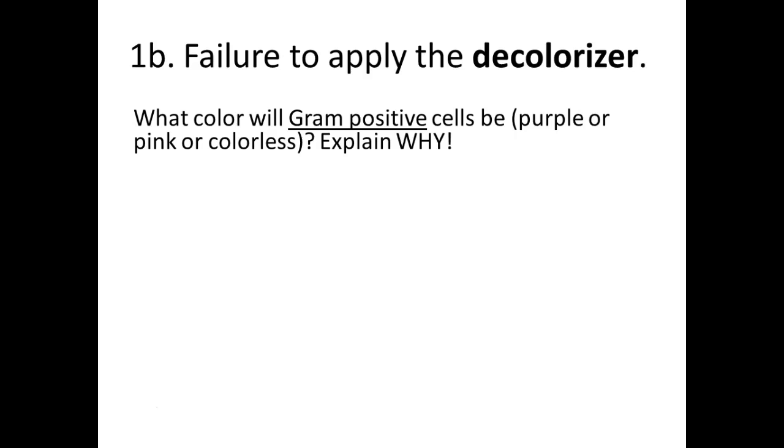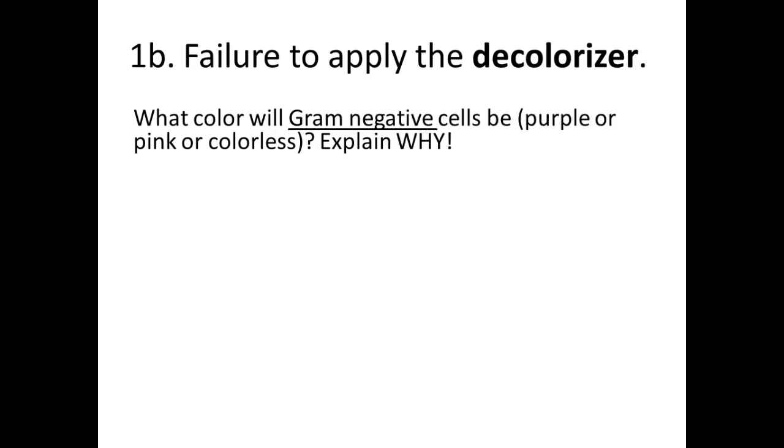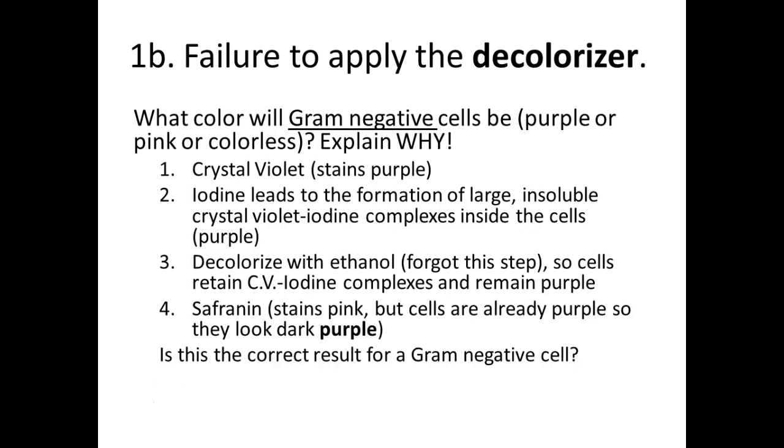Okay, what happens if you don't decolorize? Are your gram-positives going to come out as they should? Yes, because they don't get decolorized anyways. They're still going to be purple. It's going to be fine. Thinking ahead, it's when we do the gram-negatives: if we don't decolorize them, they're never going to become colorless to then become red. Instead, they're going to stay purple, which is the same as our gram-positives. We've got 2 purple cells. We can't tell the difference between gram-positive and gram-negative.